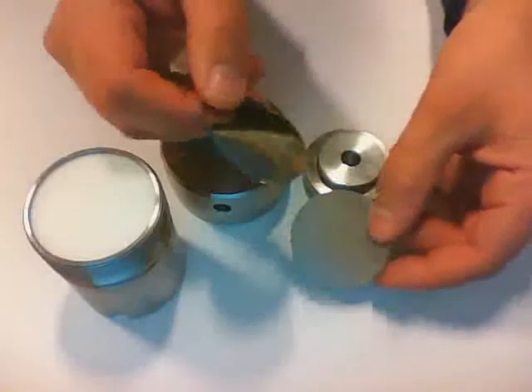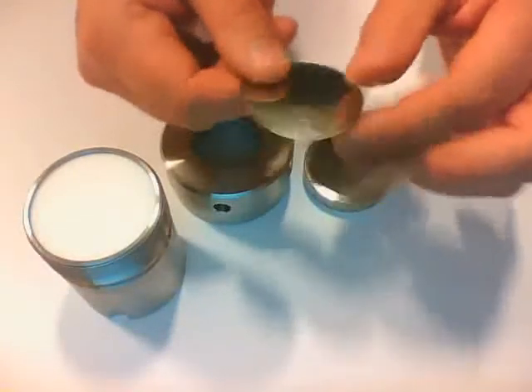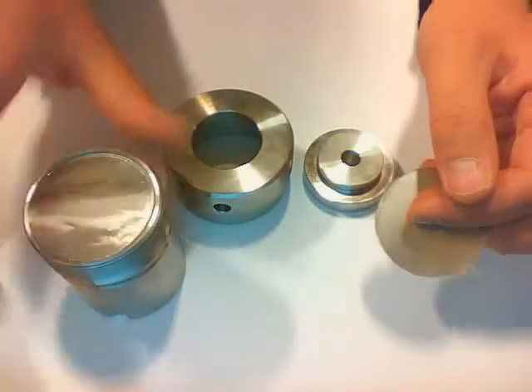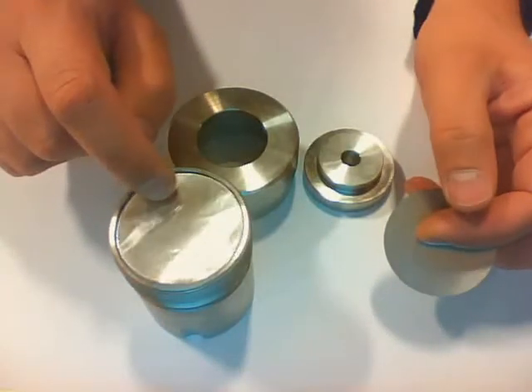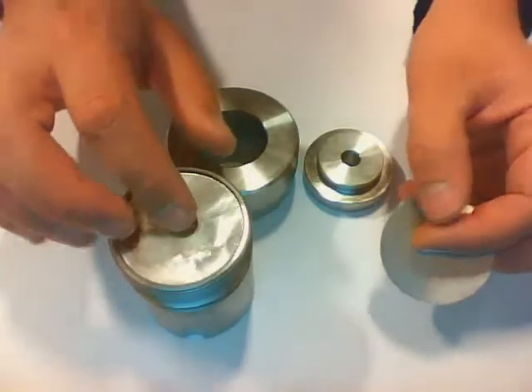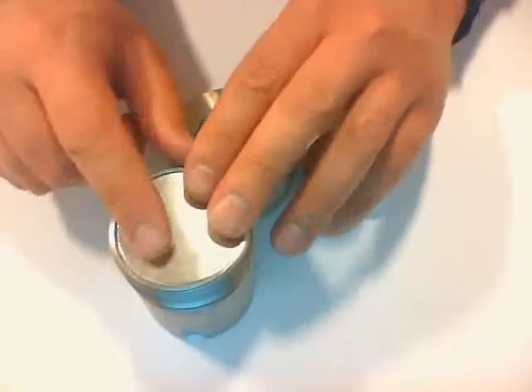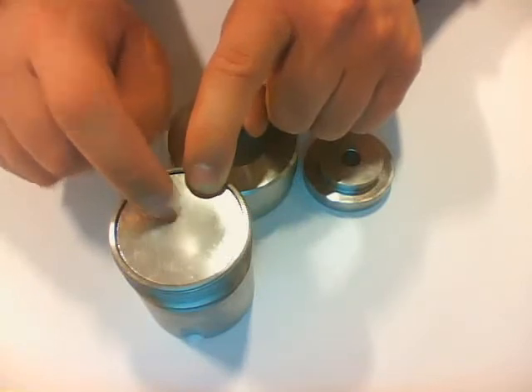These two foils might look identical, but one is thinner — you can hear that you can buckle it much more easily. The thinner one is the corrosion foil and goes on top first, so that if anything leaks from inside the teflon vessel, it will attack the corrosion foil and not the burst diaphragm. The burst diaphragm goes on top of that, and this is the one that actually ensures the pressure inside the vessel.